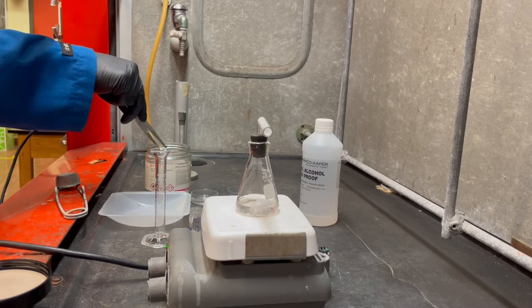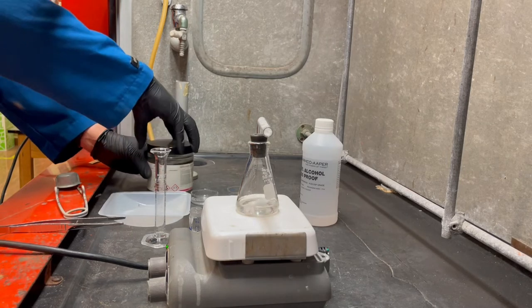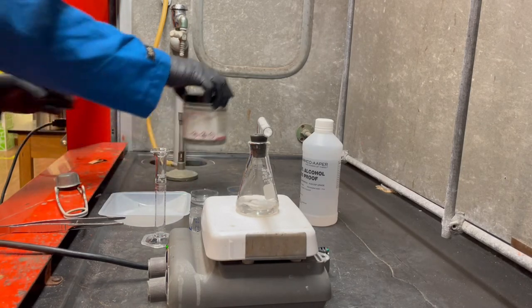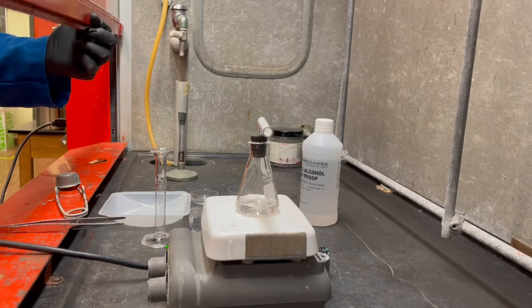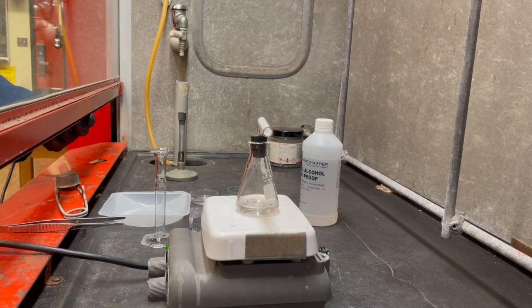So, yeah, there's actually, maybe I'll send you guys a video. There's a video of if you put just potassium or sodium inside of water in the hood, it'll start to bubble and fizz. And if you put too much, it heats up too much. The hydrogen gas kind of pops and explodes a little bit, and the beaker could explode as well. So that's why I'm lowering the hood just for safety, right?